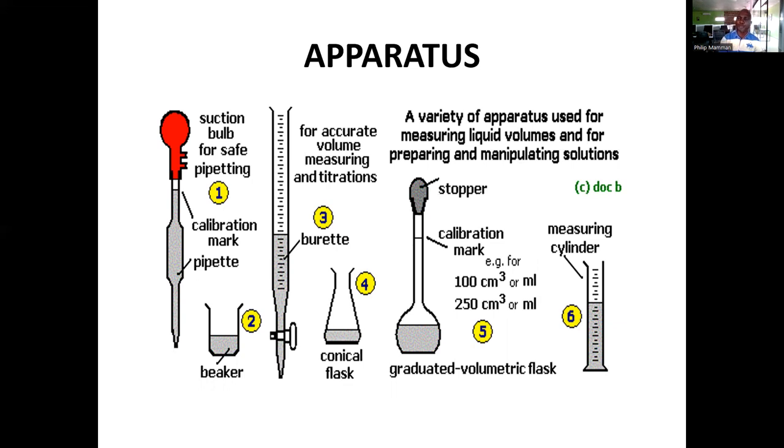You must ensure that the pipette is uniform throughout the experiment, throughout the class. Every member of the class must have the same volume of pipette because your grading will be based on the list or the submission made by your teacher of the volume of your pipette. So ensure that you have the same pipette as your teacher. Ensure that every other person in the lab that is performing this experiment is using the same volume of pipette. Very, very important.